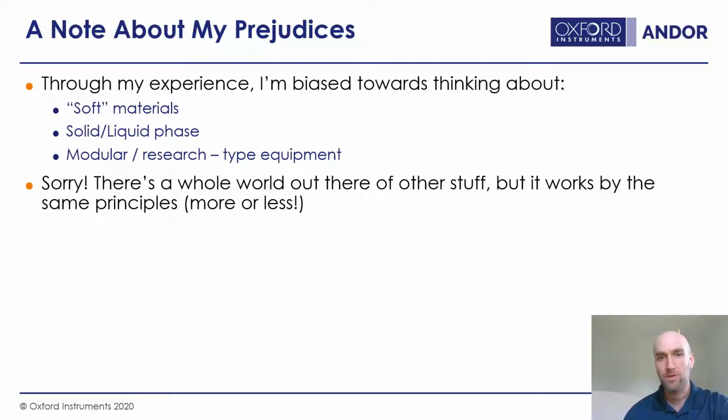I would love to talk about those more if we get some time, and they're fantastic tools, but usually we're talking more about the very fancy Lego kits of optics and discrete parts for detectors and spectrometers and optics glued together with optomechanics in a kind of extensible and reconfigurable way. So I just want to say sorry in advance for giving you this little keyhole view, but there's a whole world of stuff out there, and hopefully this will whet your appetite for more of it. It works by the same principles, but oftentimes the purpose-built systems are a little more polished and maybe operate faster and so on.